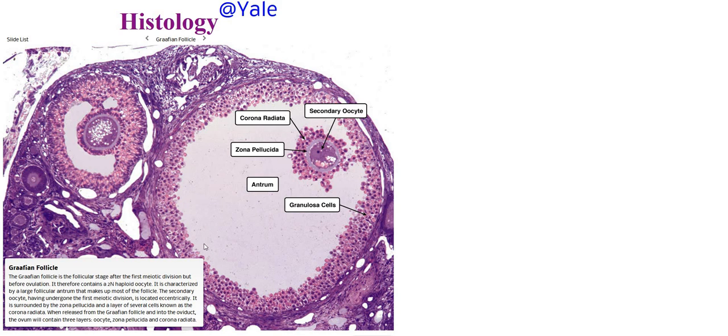We now have this really big space in the middle that is called an antrum. This is going to be filled with follicular fluid, and the oocyte also looks different. In this case, once we reach this mature version of the follicle, we call the oocyte a secondary oocyte. It has now matured and it's ready to be released to the fallopian tubes. So during normal ovulation, this follicle is going to rupture to release that secondary oocyte. So this will break apart.